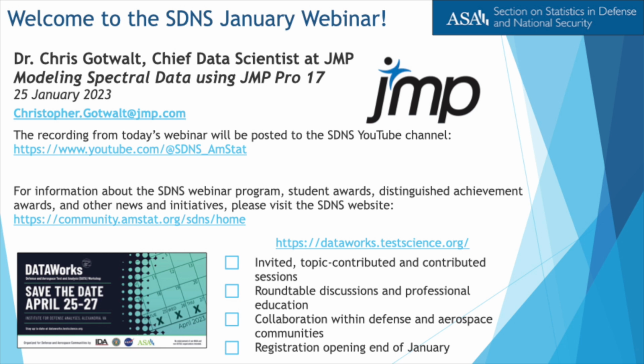Today, I'm really excited to have Dr. Chris Gotwalt from JMP speaking for us. He will be giving an overview of functional data analysis and showing some of the new capabilities in JMP Pro 17 designed to help analyze spectral data that is commonly seen in chemical, pharmaceutical, and biotech industries.